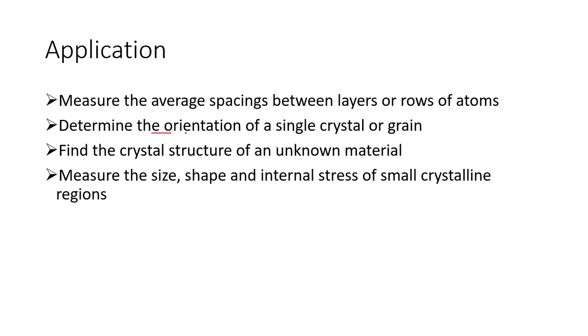If the material is unknown, we can find the crystal structure, and measure the size and internal stress of small crystalline regions. So these are the applications of X-ray diffraction.